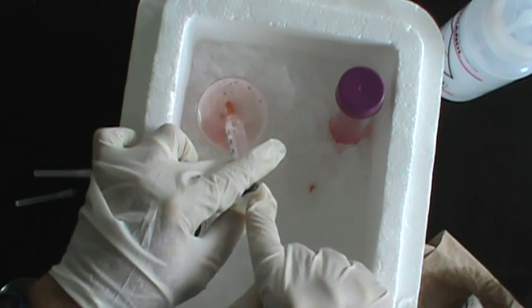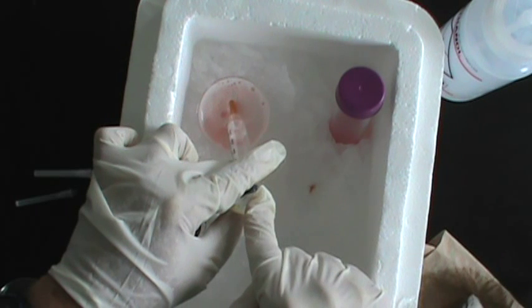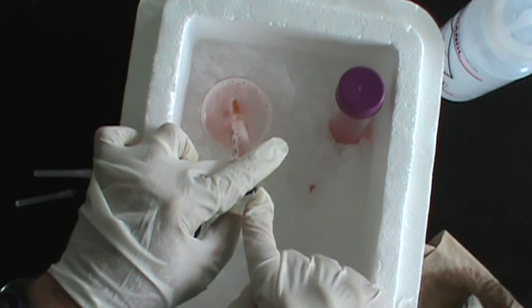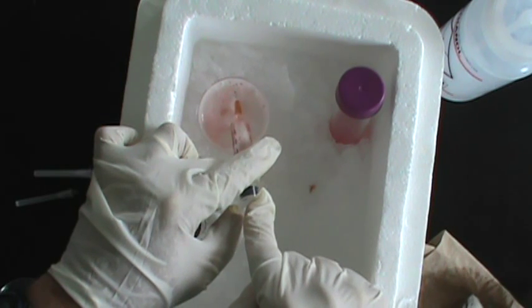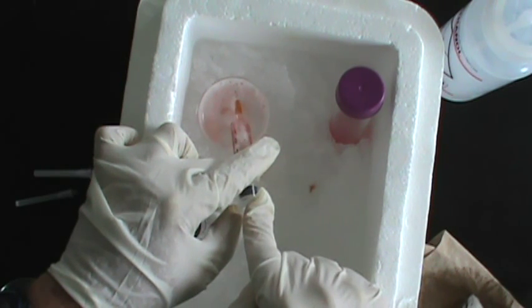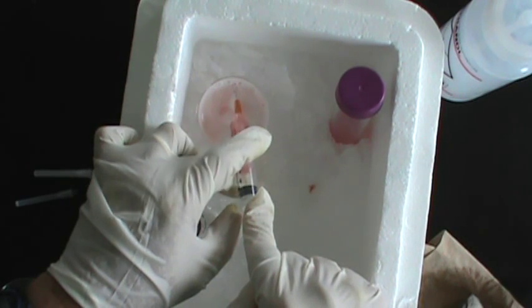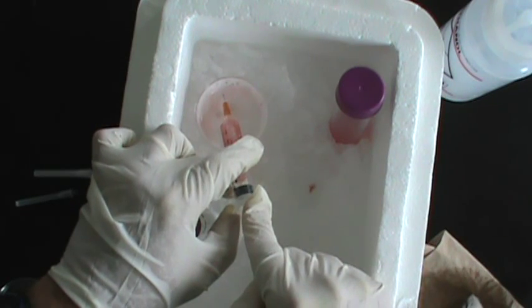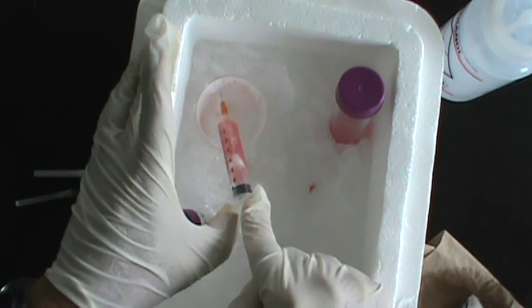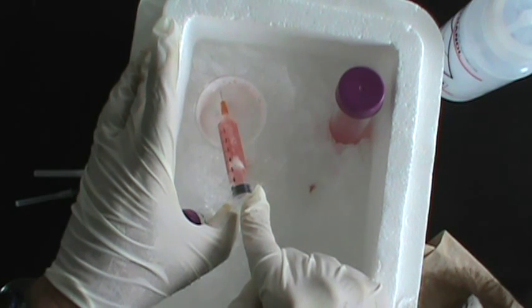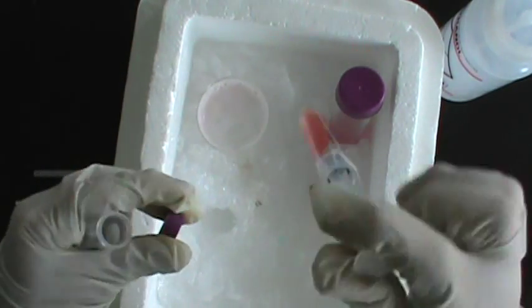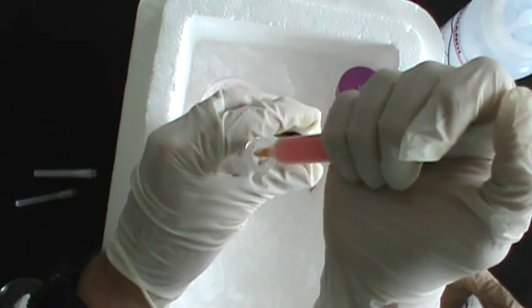Now the last time that you draw this solution up into the 26 gauge needle, you do not want to expel it back into the small petri dish. This is the last time we're going to put this material through the needle, so at this time we want to transfer our suspension of spleen cells into the 15 milliliter centrifuge tube.